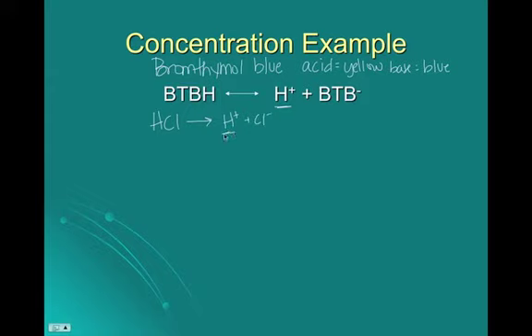Now this time it's our hydrogen ion that's the common ion, not the chlorine. So the chlorine doesn't really do anything. Later you'll learn it's what we call a spectator ion. And so if you add acid, that increases the amount of hydrogen. You shift away from what was added towards this BTBH, where the bromothymol blue is actually bonded to the hydrogen, and it's this compound that's yellow.